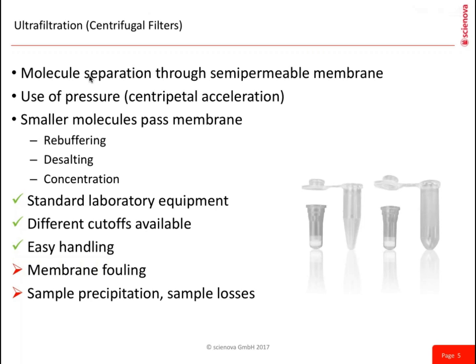You don't need special equipment in the lab, and there are many different cutoffs available, and the handling is very easy. But there are some limitations too. Due to the reduction of the sample volume, membrane fouling could occur, a sample could precipitate, and this results in losses of your sample.